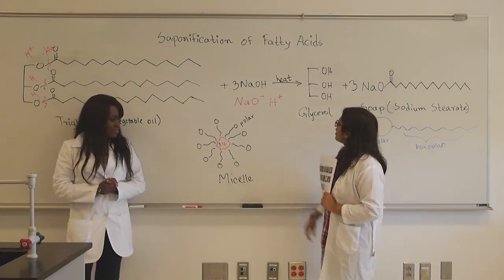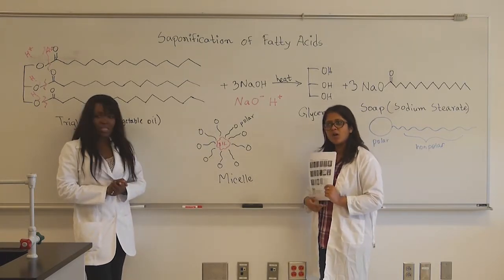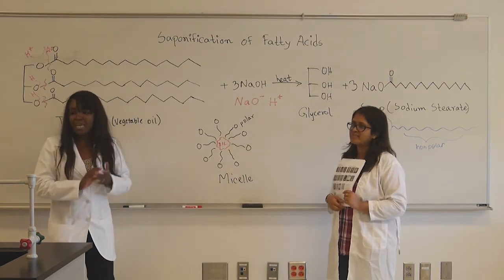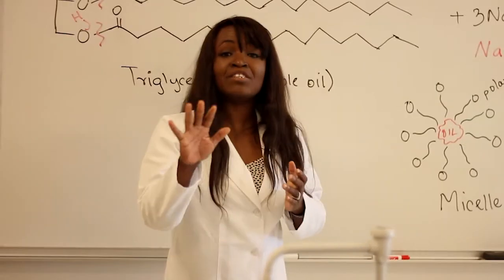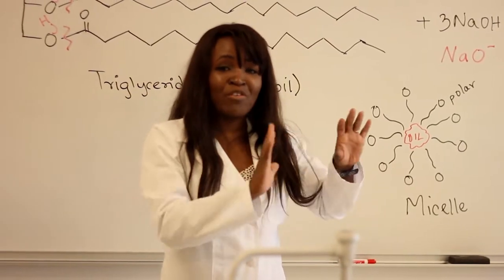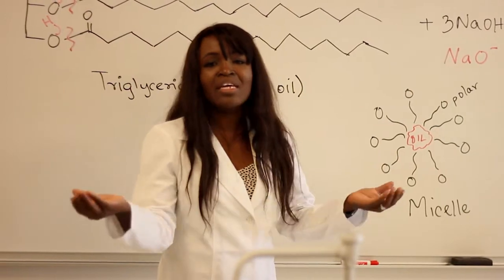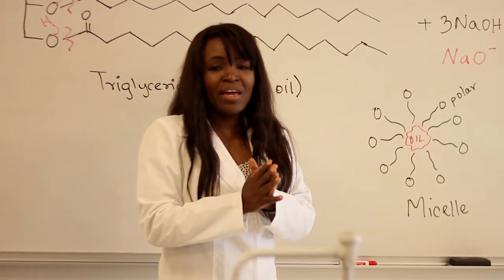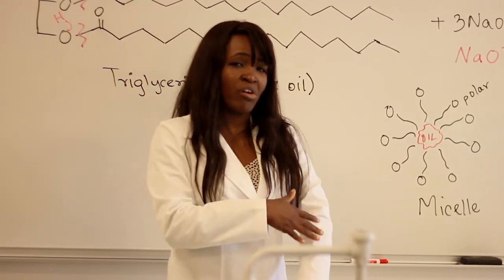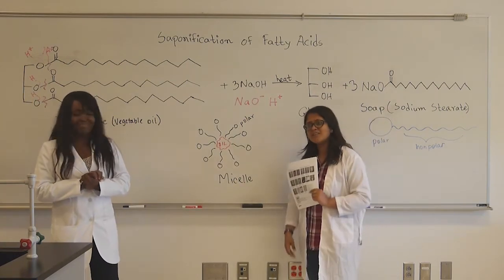And the lab will be of making a soap and to see if the soap is of good quality or not. Some tests. You will not use this soap on your body. Yeah. Let the real scientists in the lab who have been hired and vetted to make sure that they know what they're doing make this soap. You can use the soap you buy from the grocery store or wherever, but for this soap that you're making, you're just trying to make sure that it's actually decent and it will work as a soap, but you will not use it on your body because it might end up being too dry and irritate your skin. Exactly. So that's the gist of the lab.